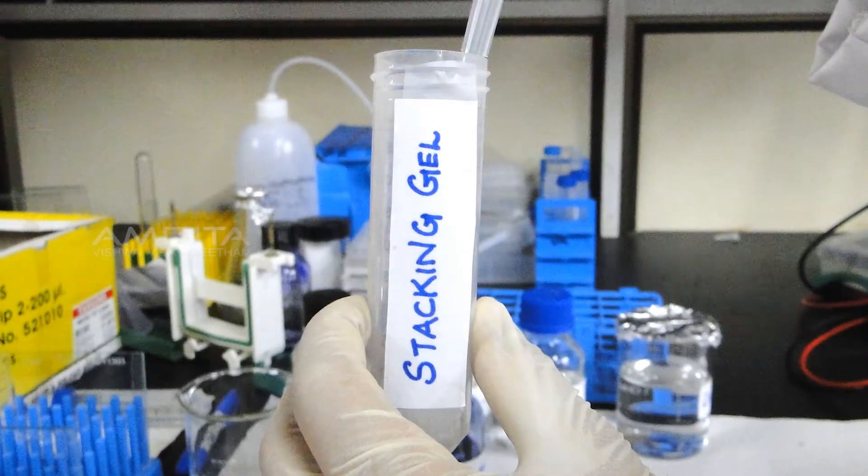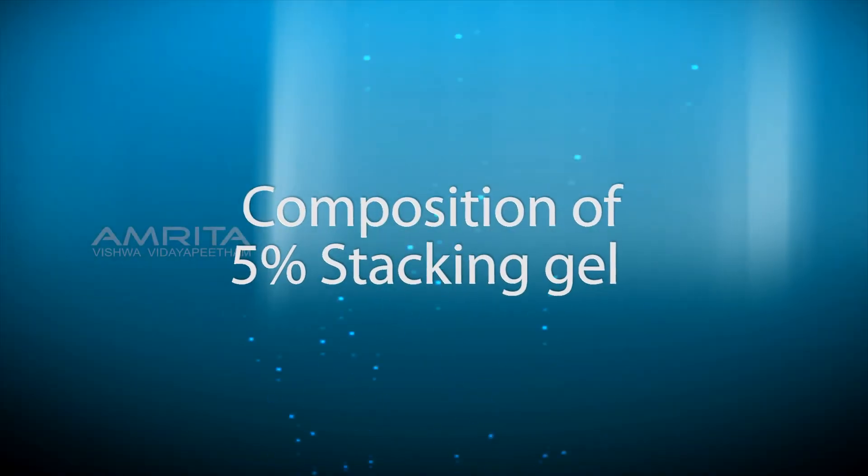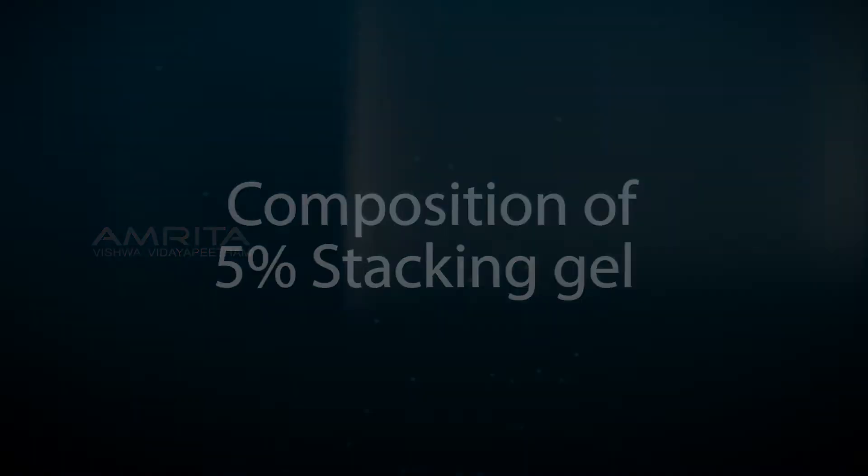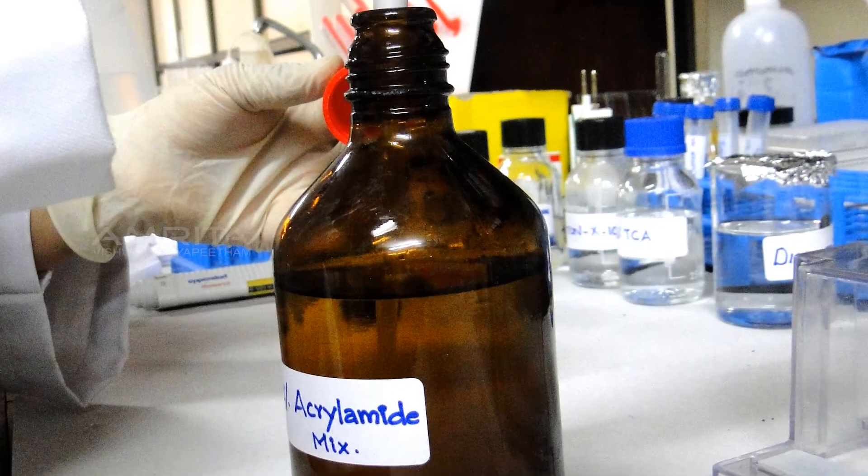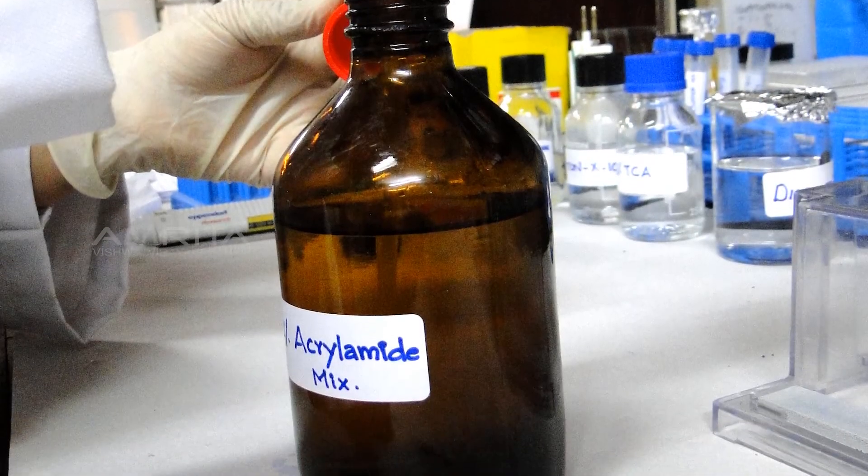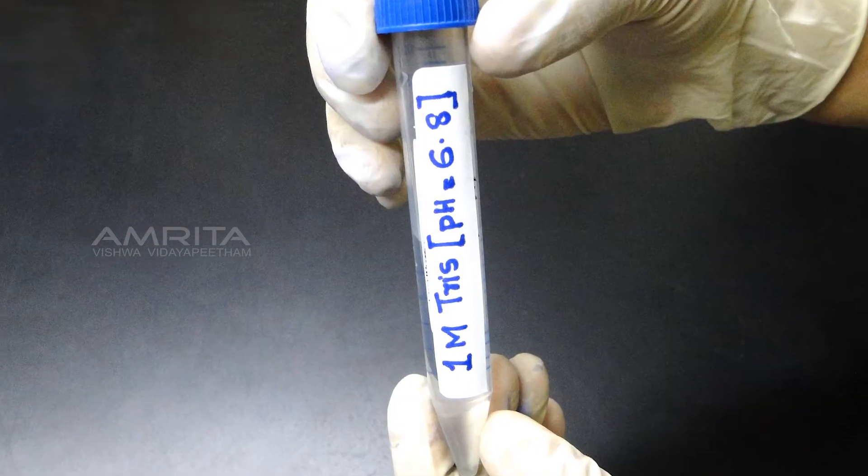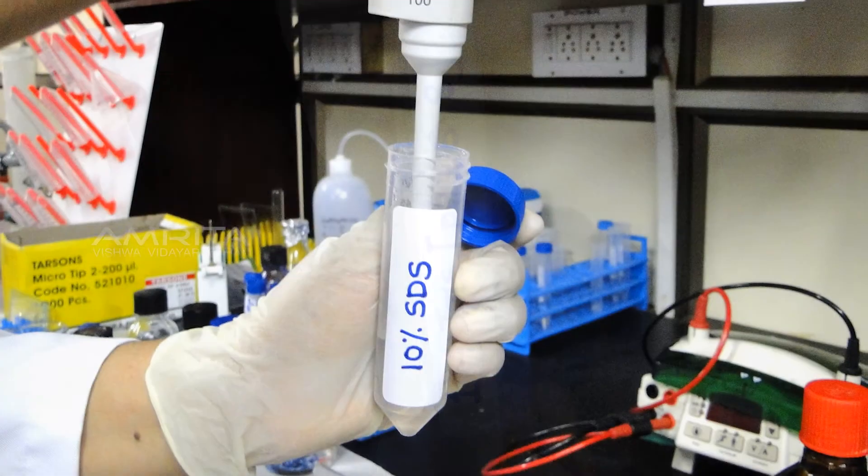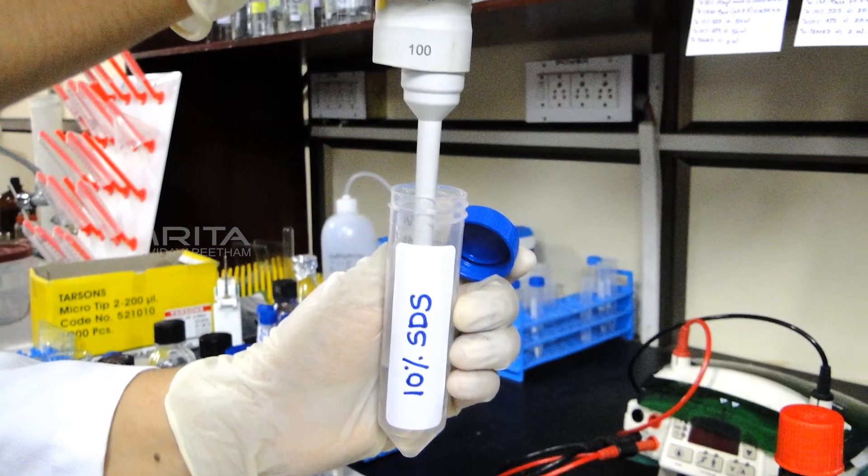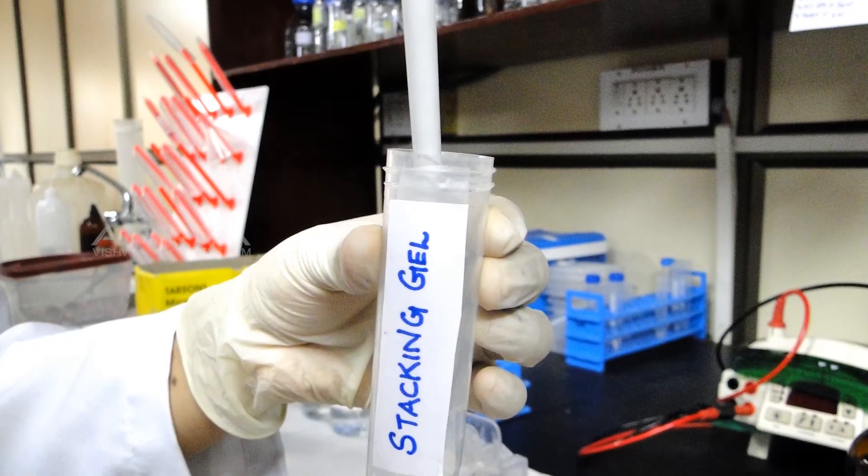During this time, prepare the stacking gel. The composition of 5% stacking gel: 3.4 ml of distilled water, 0.83 ml of 30% acrylamide-bisacrylamide mix, 0.63 ml of 1 molar Tris of pH 6.8, and 0.05 ml of 10% SDS. Add these reagents into a blue capped tube labeled stacking gel.